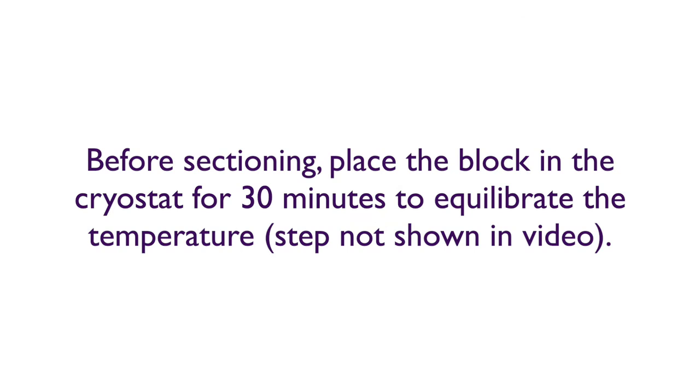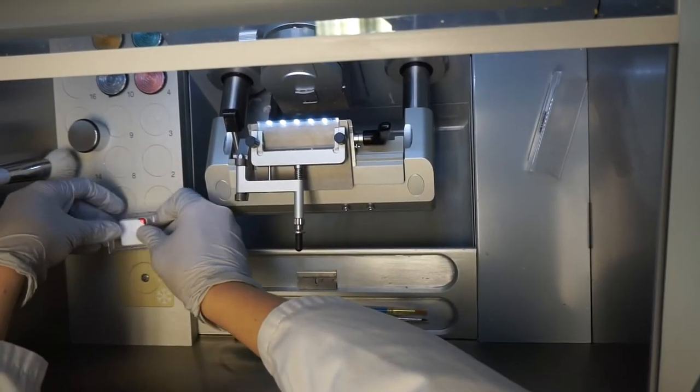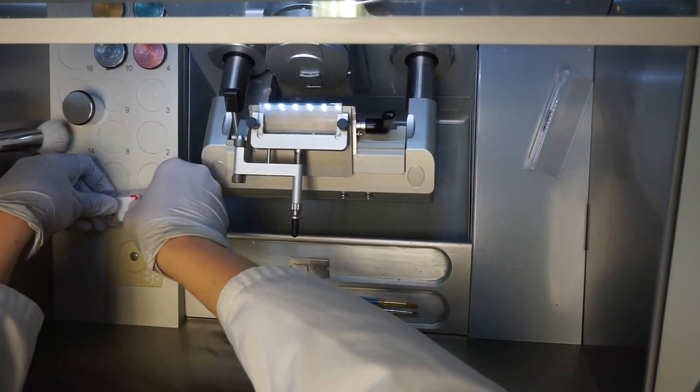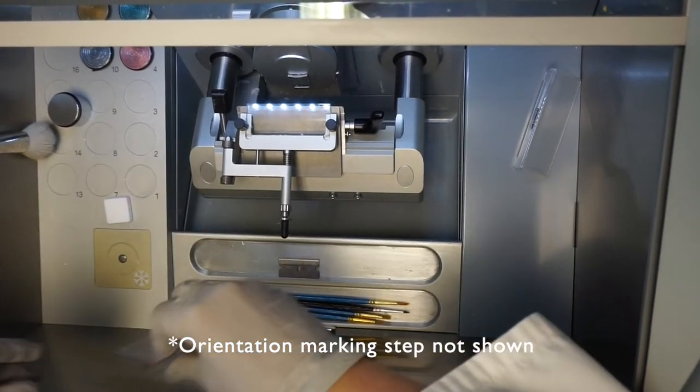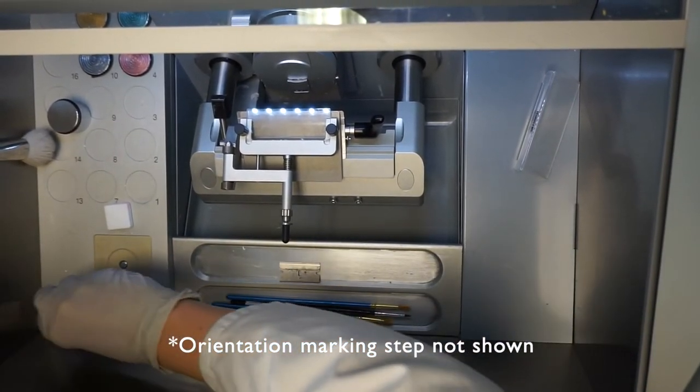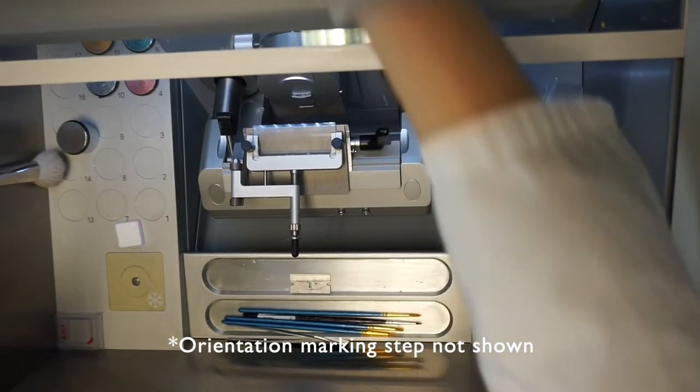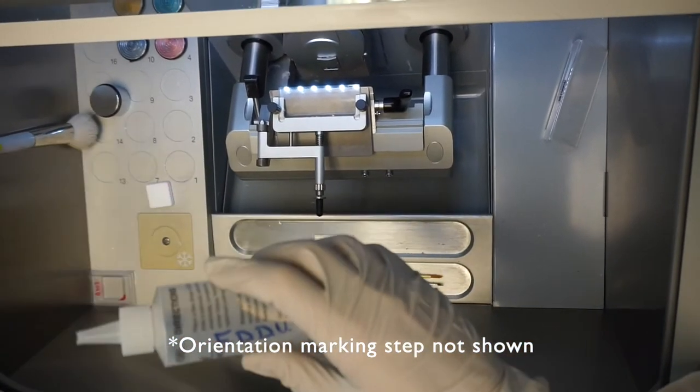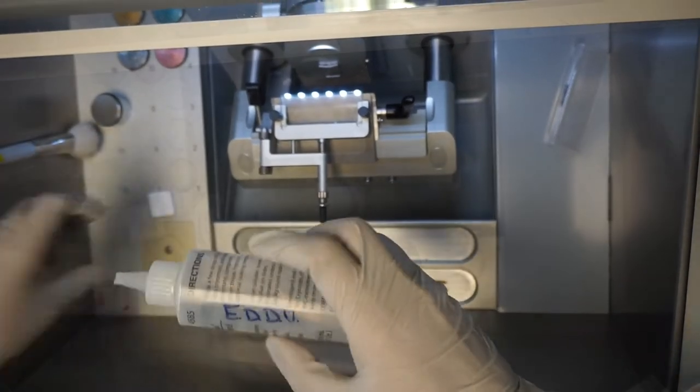Before sectioning, place the block in the cryostat for 30 minutes to equilibrate the temperature. Remove the block from the mould, always keeping track of the orientation. To help with this, mark the bottom side of the block by cutting an edge prior to removal, or make a mark using a permanent marker. Record the orientation of the mark in your lab notebook for further reference when analyzing the sections.